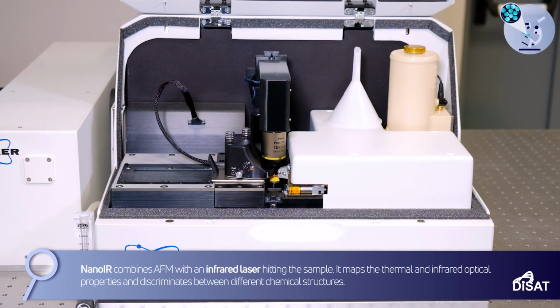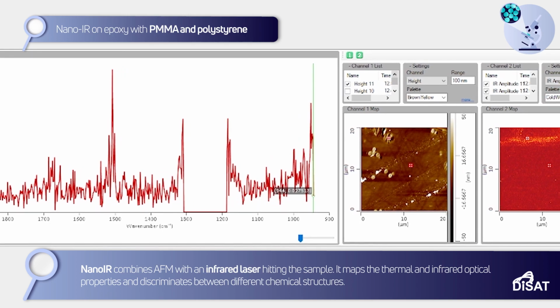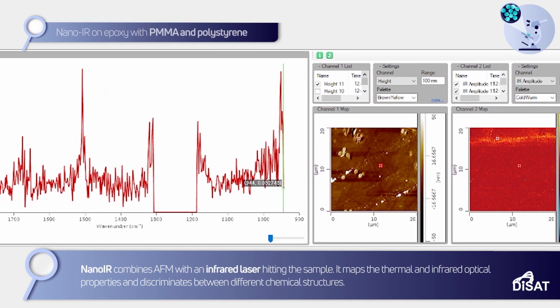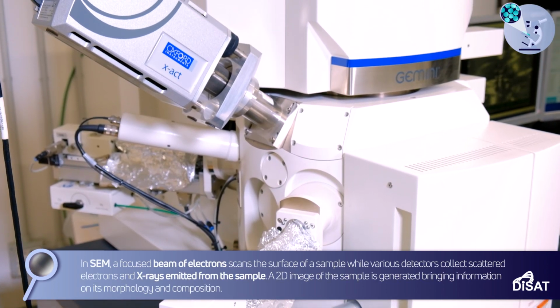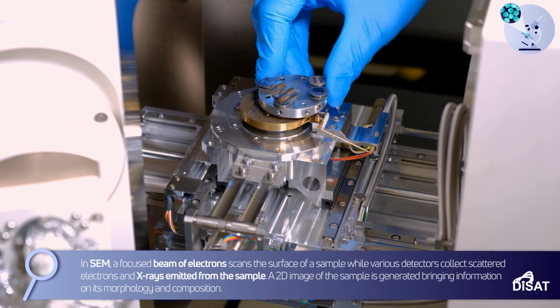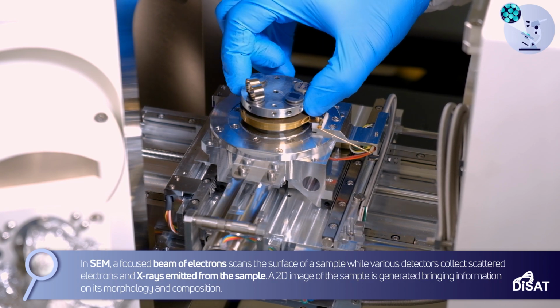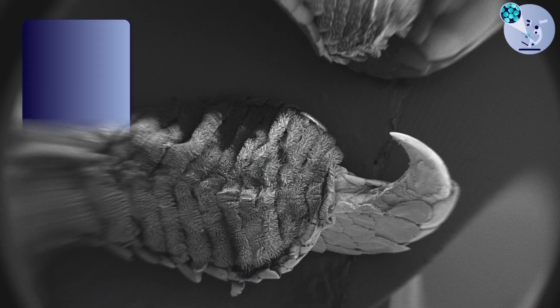Nano-IR combines AFM with an infrared laser hitting the sample. It maps the thermal and infrared optical properties and discriminates between different chemical structures. In SEM, a focused beam of electrons scans the surface of a sample while various detectors collect scattered electrons and X-rays emitted from the sample. A 2D image of the sample is generated bringing information on its morphology and composition.